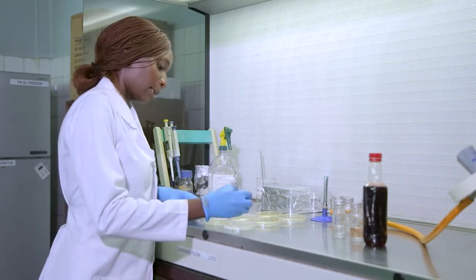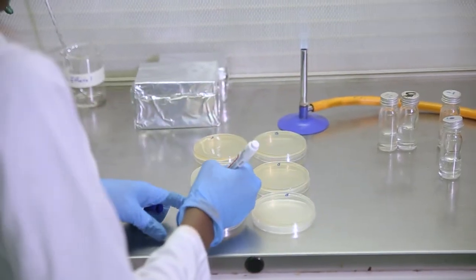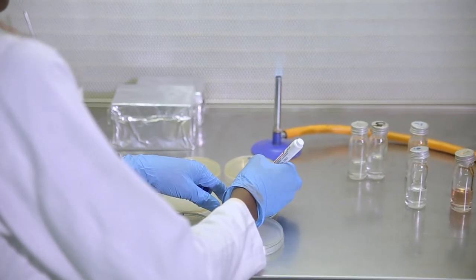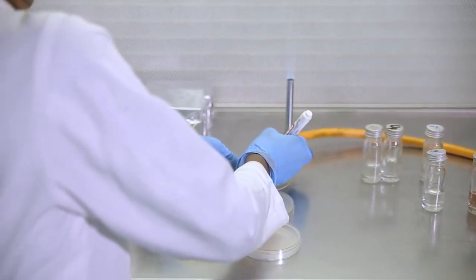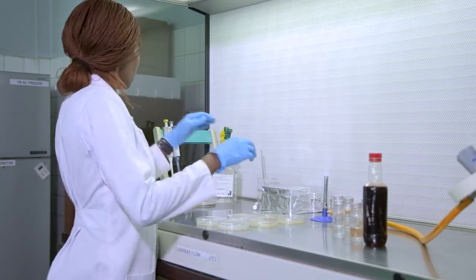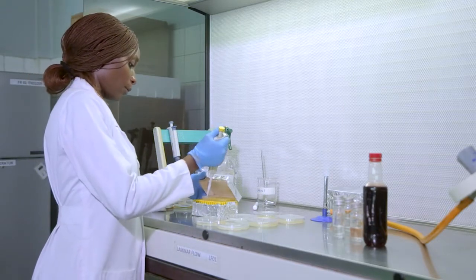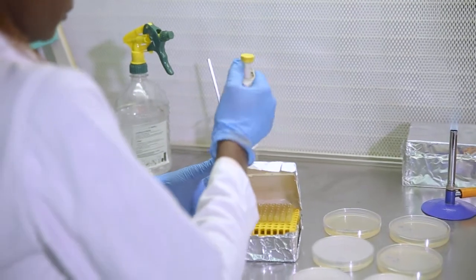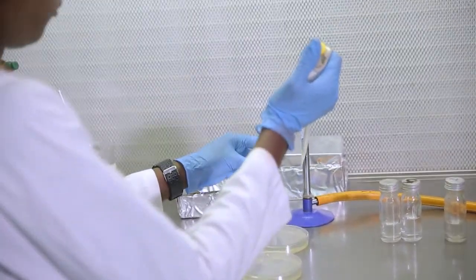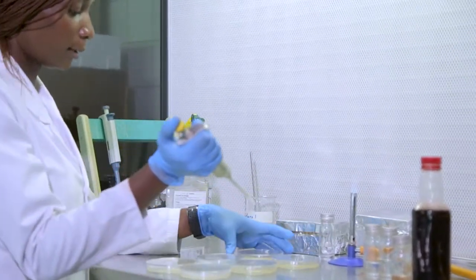So again, I'll label plate A and B, like we did earlier. Okay, so here I'll consider the 10 to the power 0, 10 negative 1, and then 10 negative 3. Okay, so we turn them upright. So in this case, instead of 1 mil, I'm going to put 0.1 mil. And this I am going to put on the center of the agar.